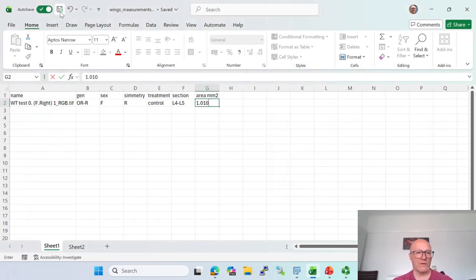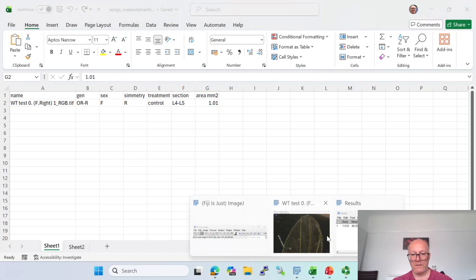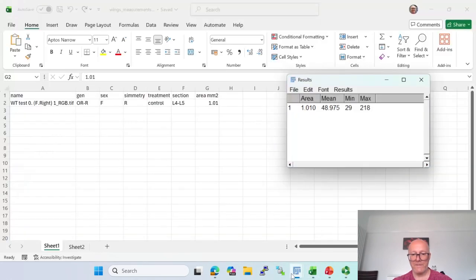And you want to make sure that you save your data. So just to show you, I would suggest that you save the file on the OneDrive. So then even if your laptop breaks down or something happens, your data is saved. Okay. So obviously this is not finished.